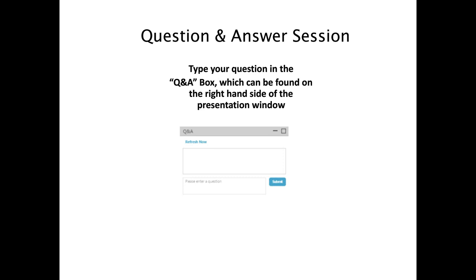What if the selectivity is different on the corresponding Halo column compared to the one I try to transfer a method from? Okay, so if the selectivity is different, you might see an improvement in the separation, or you might need to slightly adjust your experimental conditions, including the mobile phase composition and temperature, to achieve comparable selectivity with the Halo column.